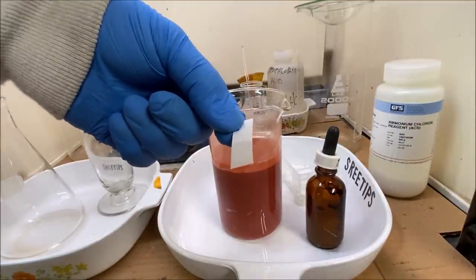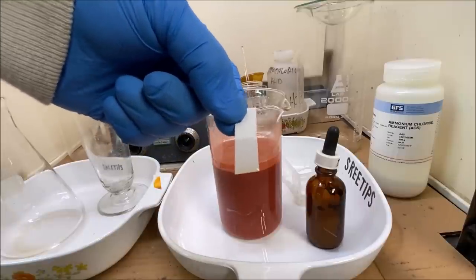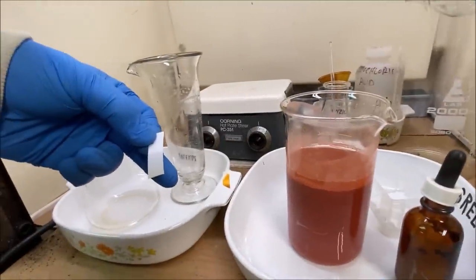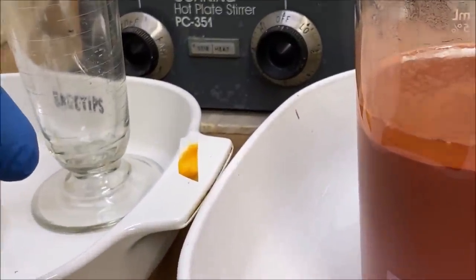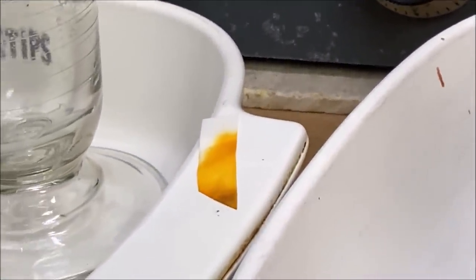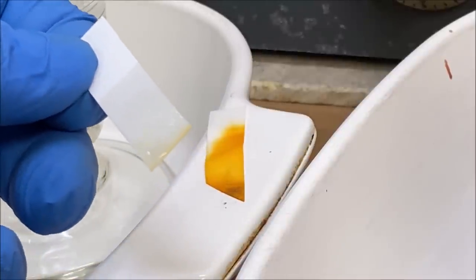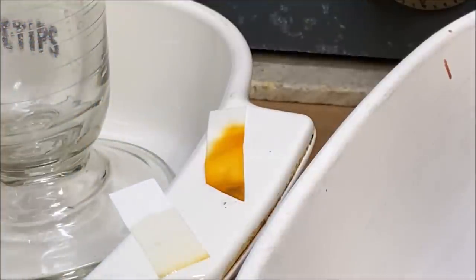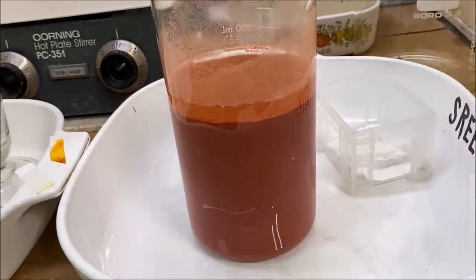Wow. You can see just about 100% of the platinum has come out of solution there. There's our initial test right down here. That thing is dark orange with platinum. And then here's this test. It's got just a touch of orange on it. So I think what we'll do here, it's going to take a while to settle. It's starting to settle. But I think what we're going to do is call it here.